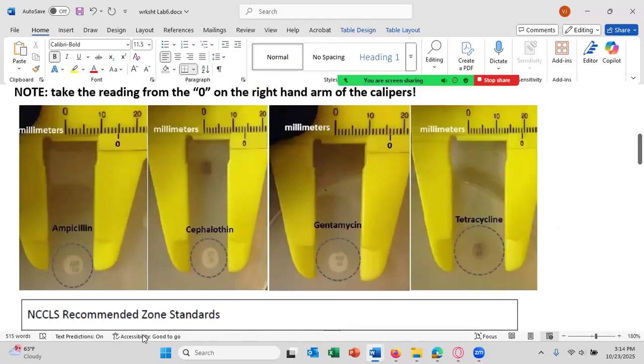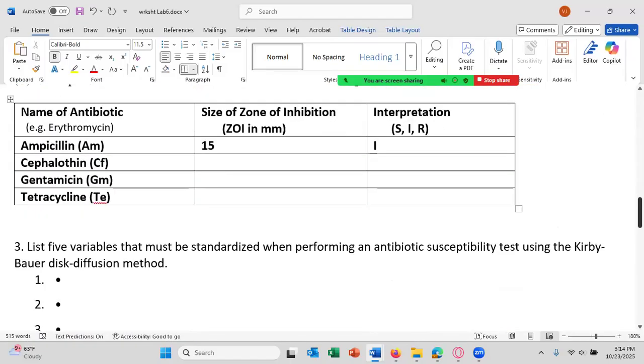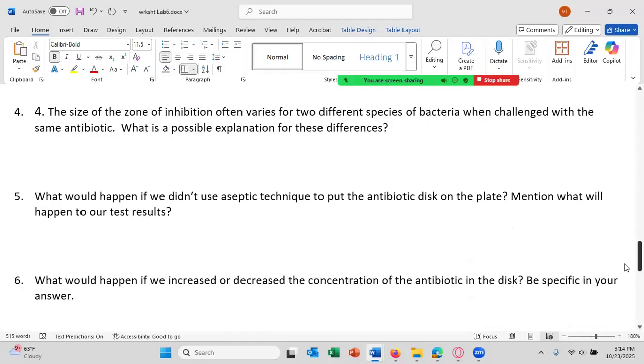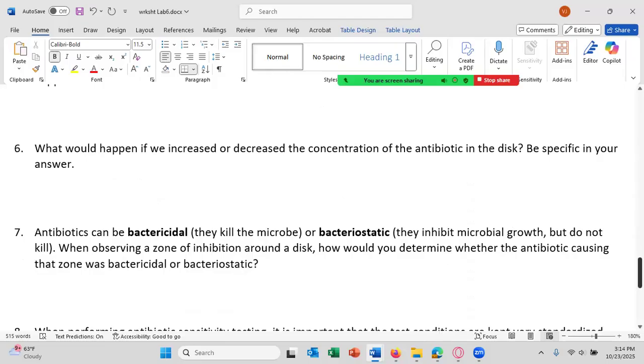Like for this right here, is that zone of inhibition from the antibiotic bactericidal or bacteriostatic? This is a thinking question. Students often get this question wrong on the first attempt, but on the second attempt, most students do get the question correct. So think about it. Like I said, that is a difficult question, but if you think about it, you can come up with the answer. It's pretty simple once you come up with the answer.